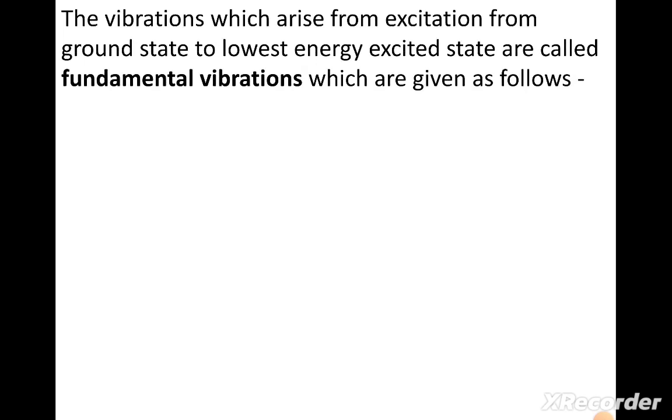The vibrations which arise from excitation from ground state to lowest energy excited state are called fundamental vibrations.